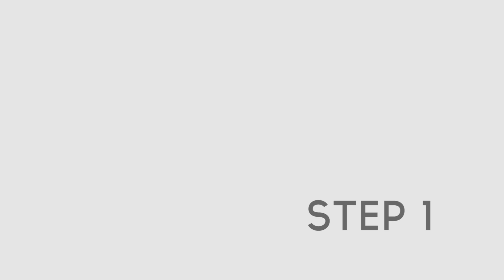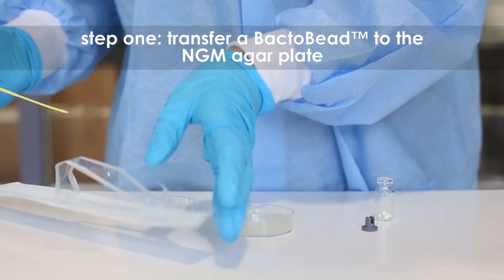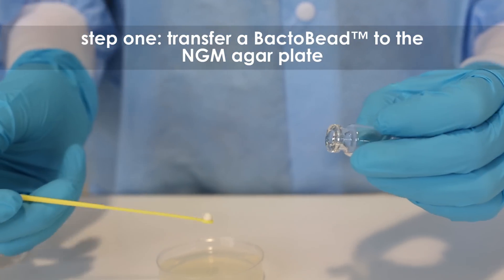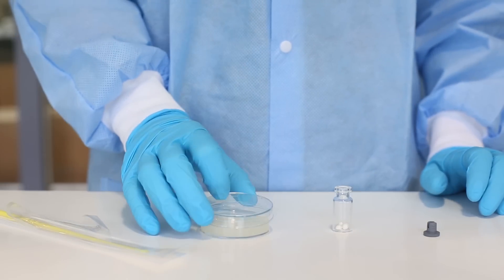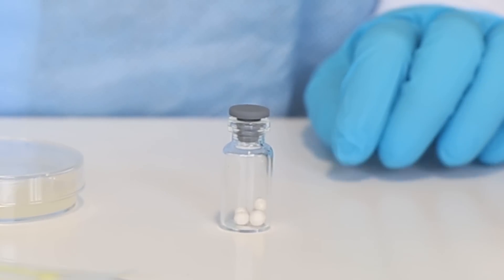Step 1: Practicing aseptic technique, use a sterile inoculating loop to transfer a single Bacto Bead from the vial to an NGM agar plate. Replace the lid of the Petri plate. Immediately cap the Bacto Bead vial to limit exposure to moisture from the air.